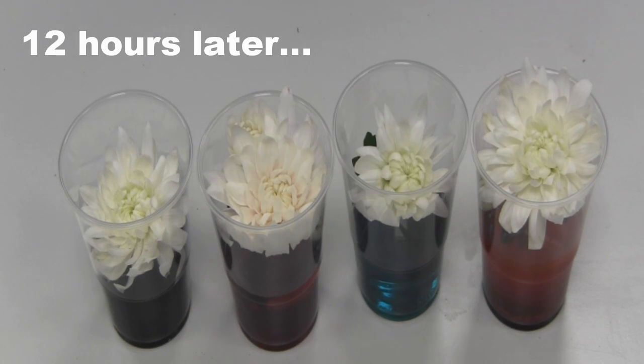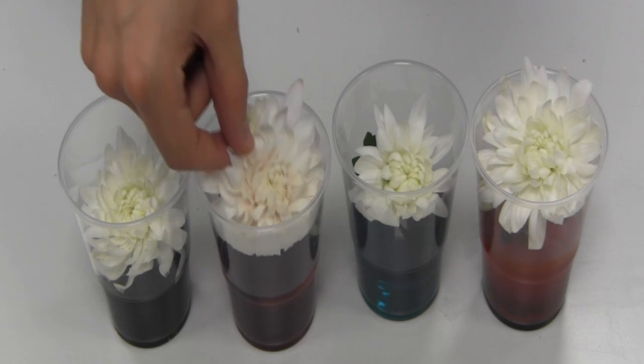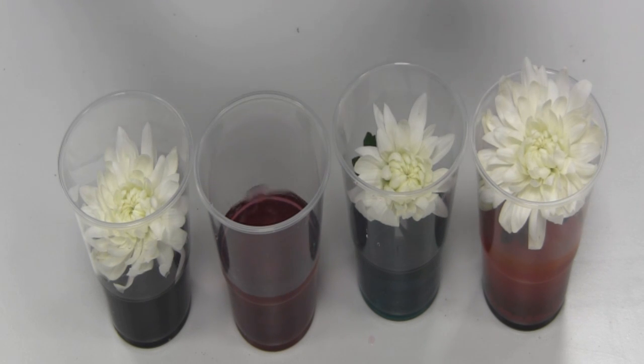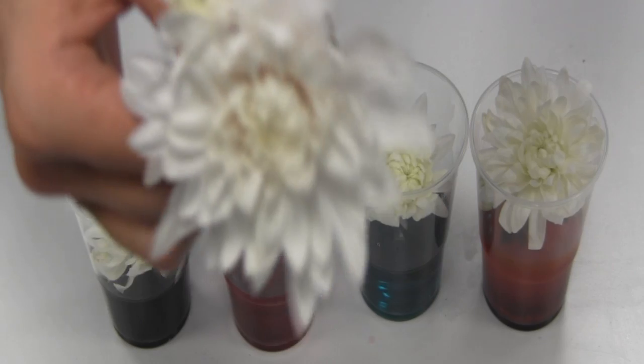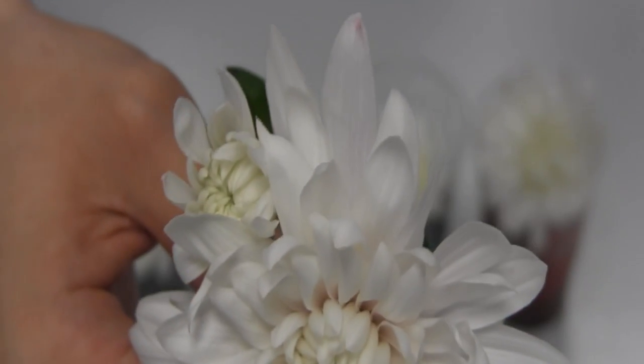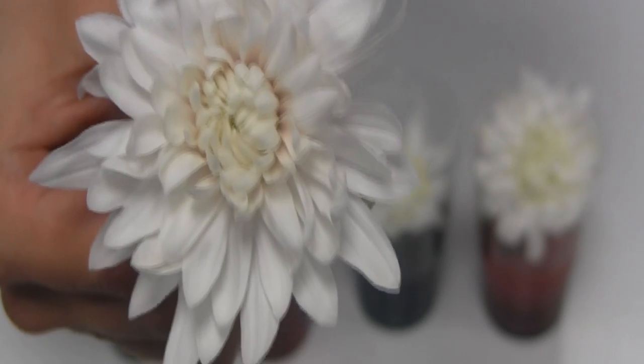So, here you can see the results from our transpiration color changing flower experiment. You can see a clear difference between the color of the pink flower and the green flower. Parts of the flower are visibly pink. There are parts of the flower where the food coloring has been particularly strongly uptaken.